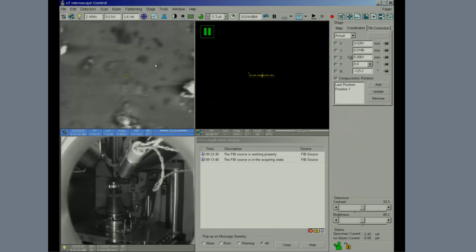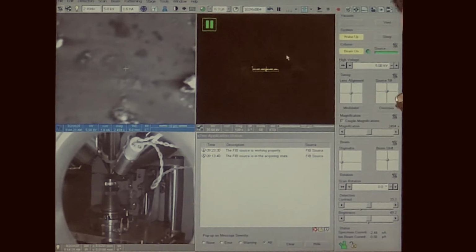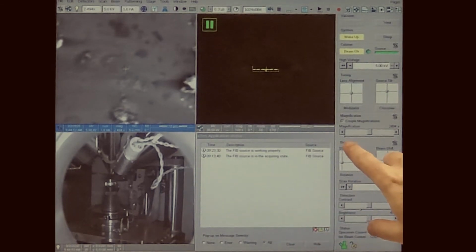We're going to adjust the stigmators. There's several ways to adjust the stigmators. The most common one is the MUI knobs. Another way of adjusting the astigmatism is if you click Shift and use the right button on the mouse, you can adjust the stigmation that way. I usually will either use the MUI knobs or I'll come over here under Beam Controls.